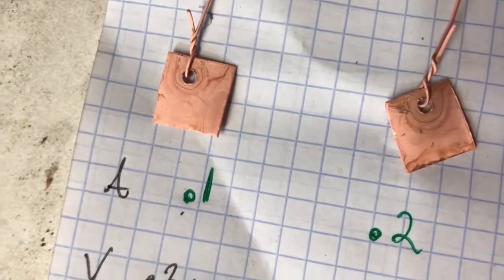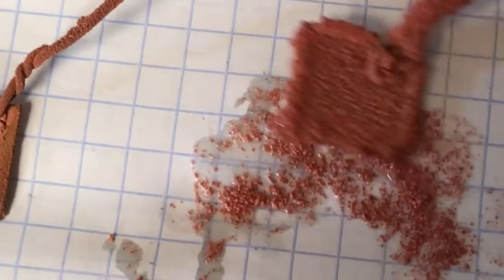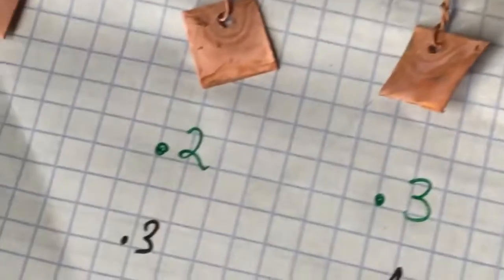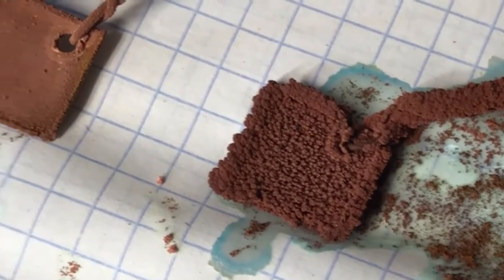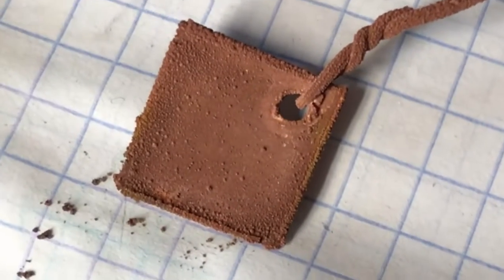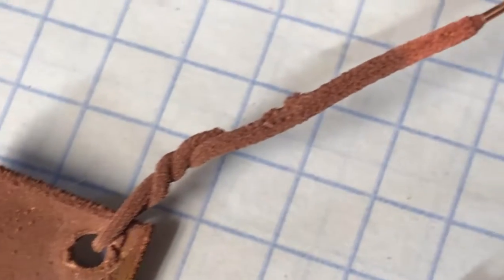I don't like the way this 0.1 and 0.2 is looking, if anything. As you get on down the line, it just gets kind of drastic. Straight up powdered metal. So we're going to take this information into consideration. As you'll notice, we did not get any crystal growth, though, per se. So it's a clean solution with no iron in it.